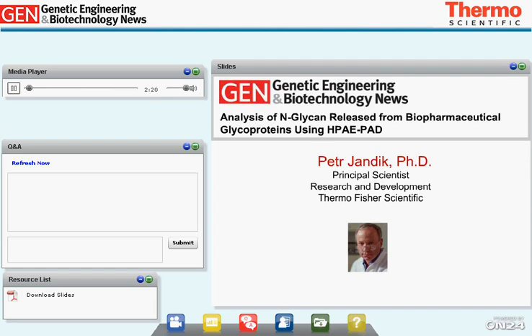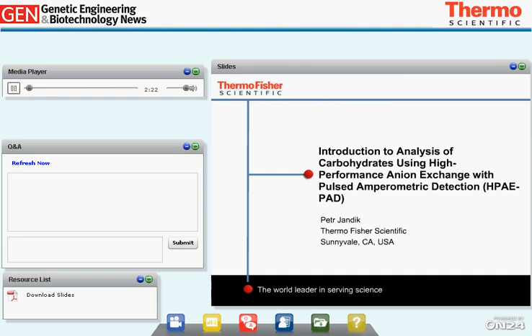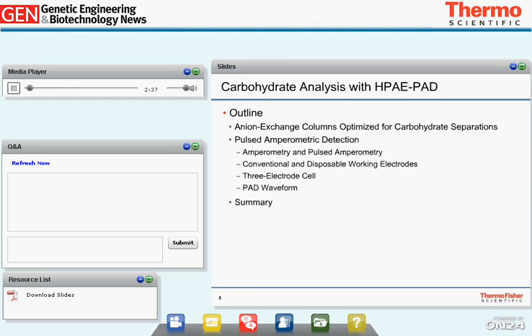Peter? Thank you, John. As already stated, we will be reviewing analysis of oligosaccharides by high-performance anion exchange chromatography with pulsed amperometric detection. We will start out with a quick look at what is high-performance anion exchange chromatography with PAD.